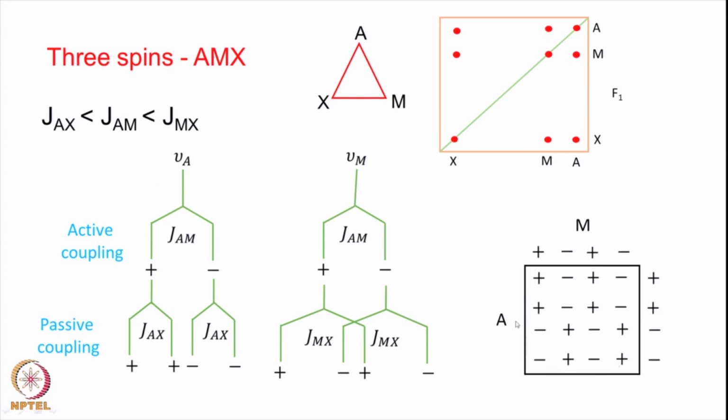Now once again we have to be concerned about the resolution and where cancellations are possible. Now the M spin has a plus minus and that depends upon the relative magnitudes of this coupling. If these two are too close, then there is a chance that the central ones will cancel and all of these peaks will disappear. If this is larger than the resolution that is available to you, then of course it will appear plus minus.